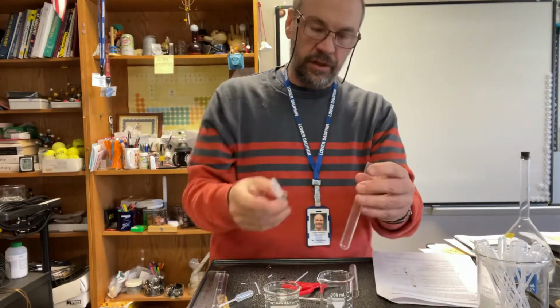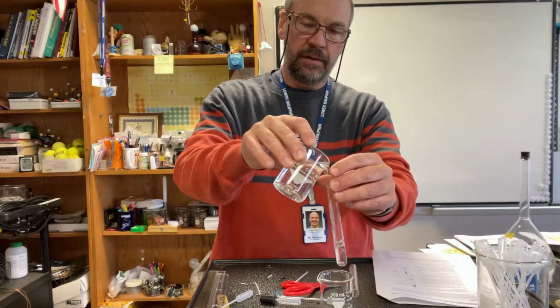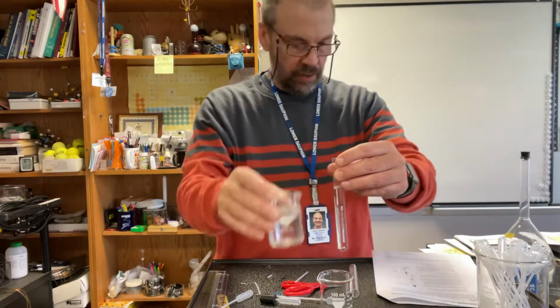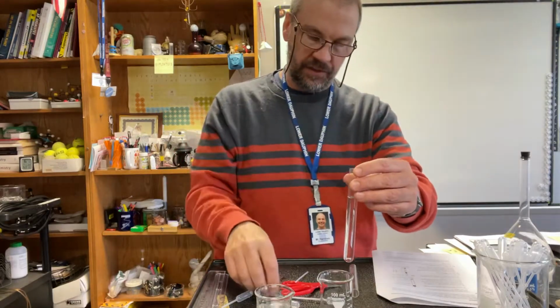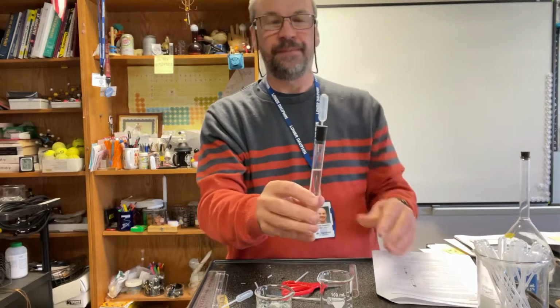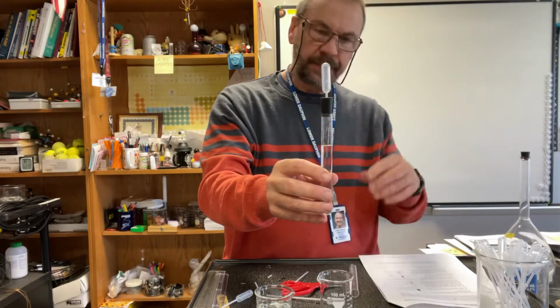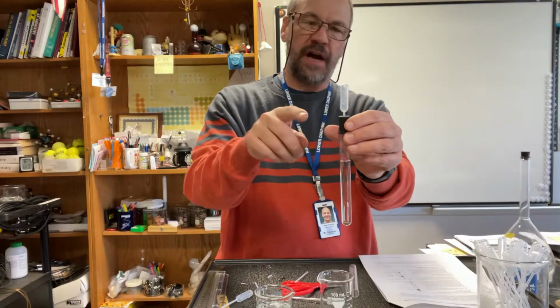And then what you're going to do is have your hydrochloric acid in your test tube. You will have the zinc in the test tube. And then you put that stopper right on top there. And that's how you're going to collect that gas. There's a little bit more to it, and Mr. Fox will show you this.